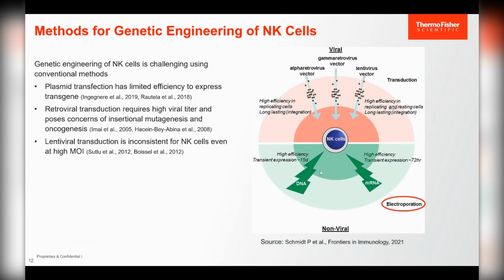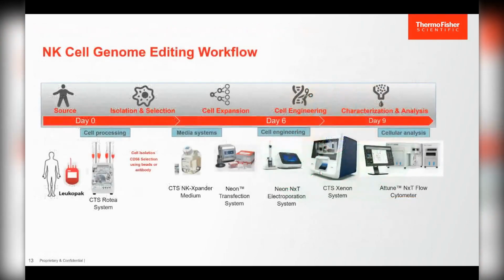So what method are people trying here? This is another method, called the electroporation method. In the coming slides, I will show you how the electroporation method helps to edit the NK cell, not only at small scale, but even at larger scale. That means a versatile and precise toolkit is urgently needed for NK cell engineering and expansion. So this is our standard workflow, and we are going to show the data in the coming slides.